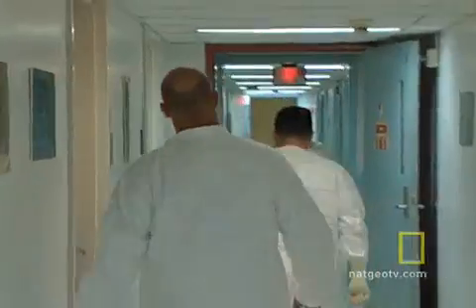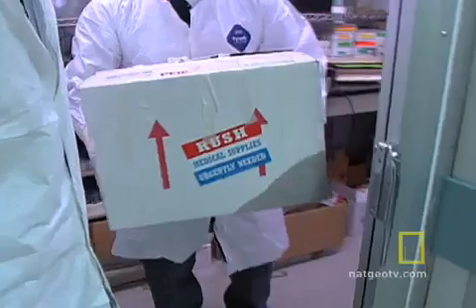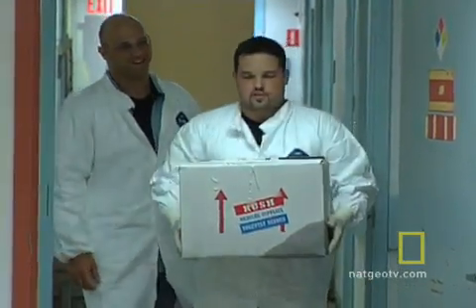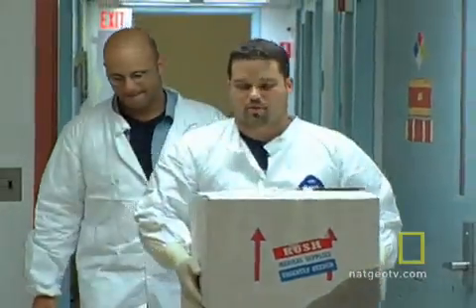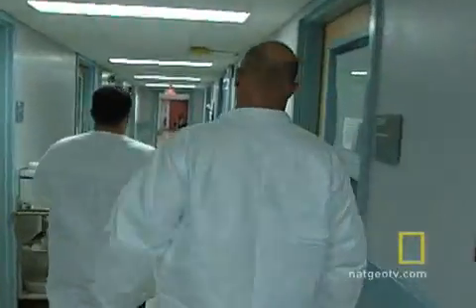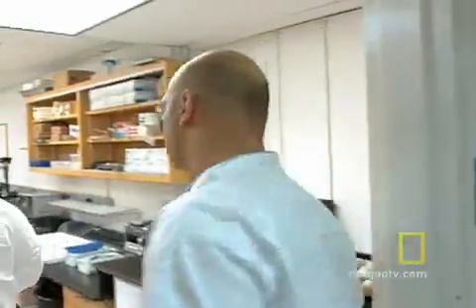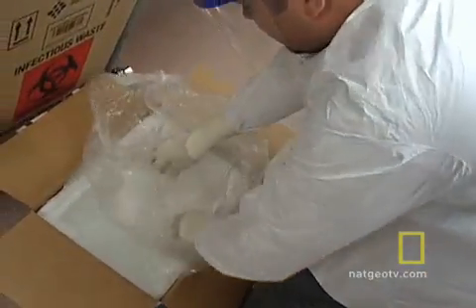11 p.m., just down a hall. A typical work night for Luis Fernandez. Earlier today, some precious cargo arrived. It's been chilling on ice all day. In that box is a recently deceased, freshly packed human brain. About all we know is it's a male, it's in its 70s, and if it's not preserved within the next hour or so, its quality will start to decline.